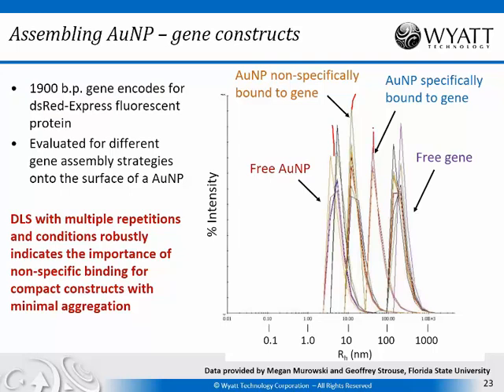That leads to a much larger size here, on the order of 50, 60 nanometers. And then here's the size of the free gene, which is measured as well. Because it is a linear construct which doesn't fold nicely like a protein, it gives you a pretty large size. So again, make all the preparations, put them into the microwell plate, and you come back with the answers in a very short time.